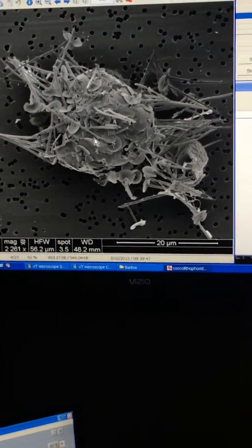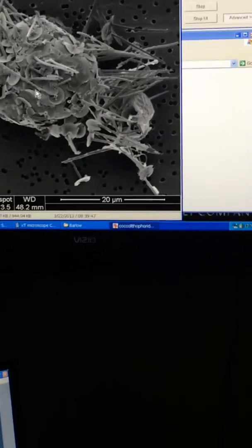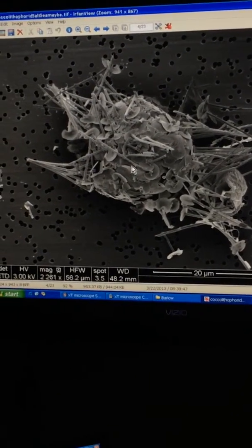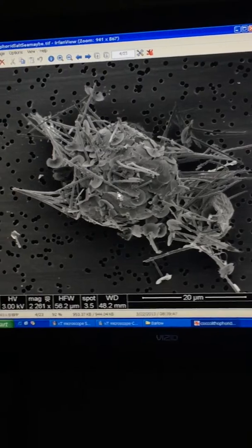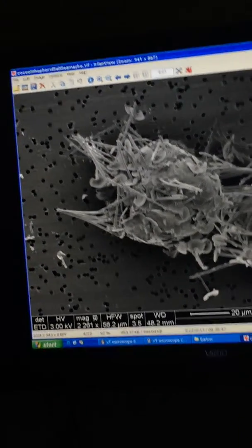And it's genetic because different organisms produce different shapes and they're constant. So when you see that shape, you can say, yes, that's in this group, and identify it down to maybe a genus or a couple of different genera. So it's, as I say, something that's got to be reproducible.